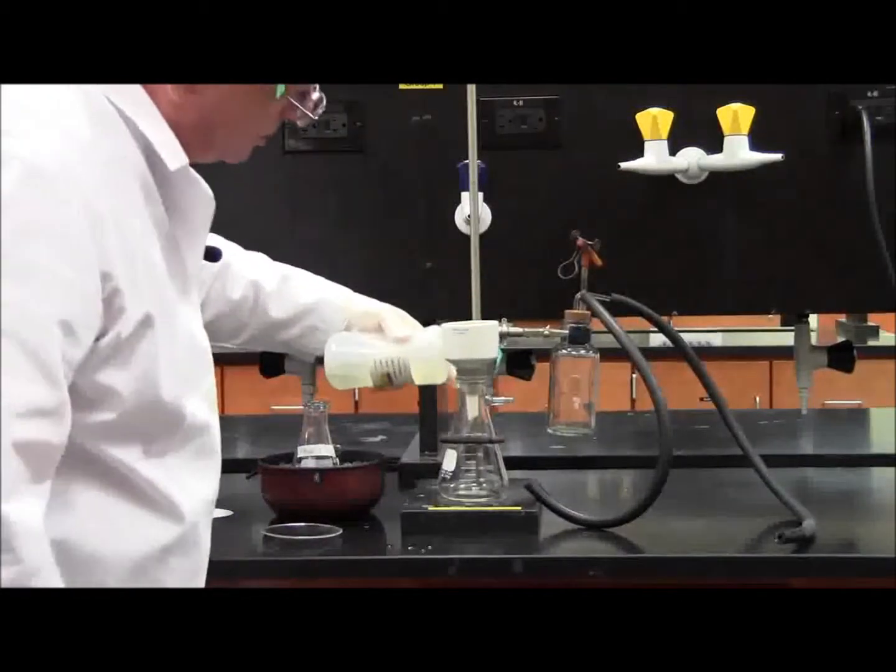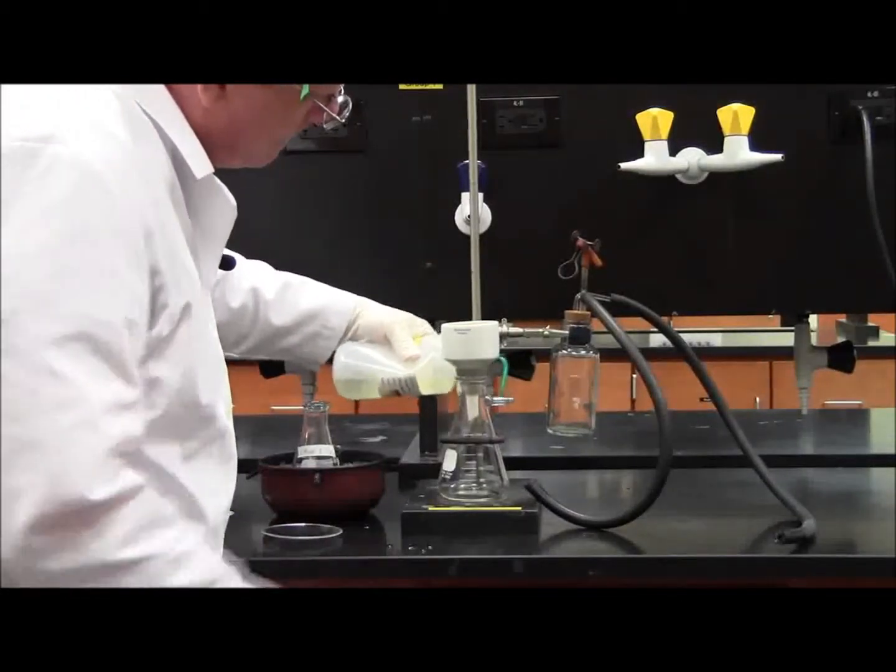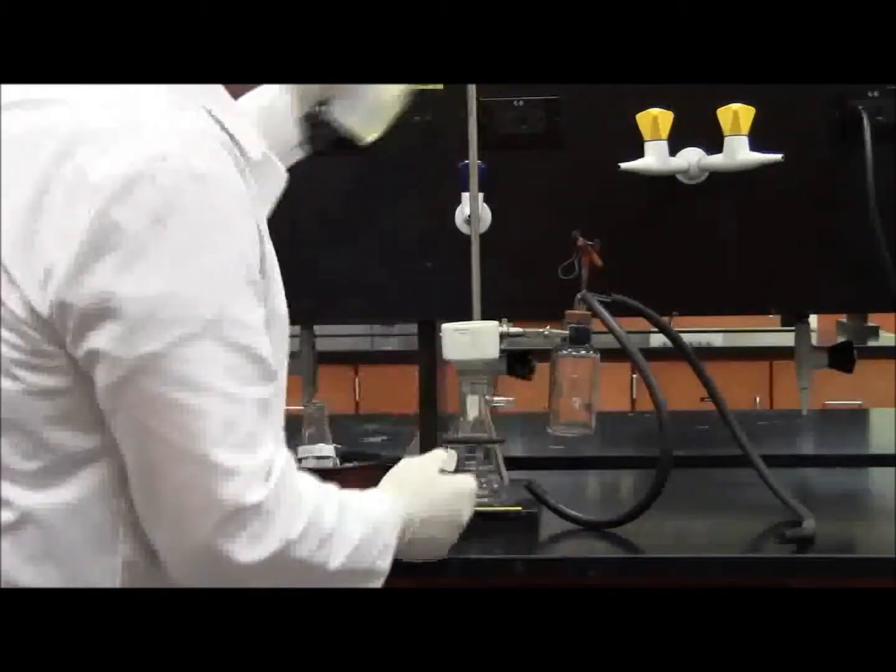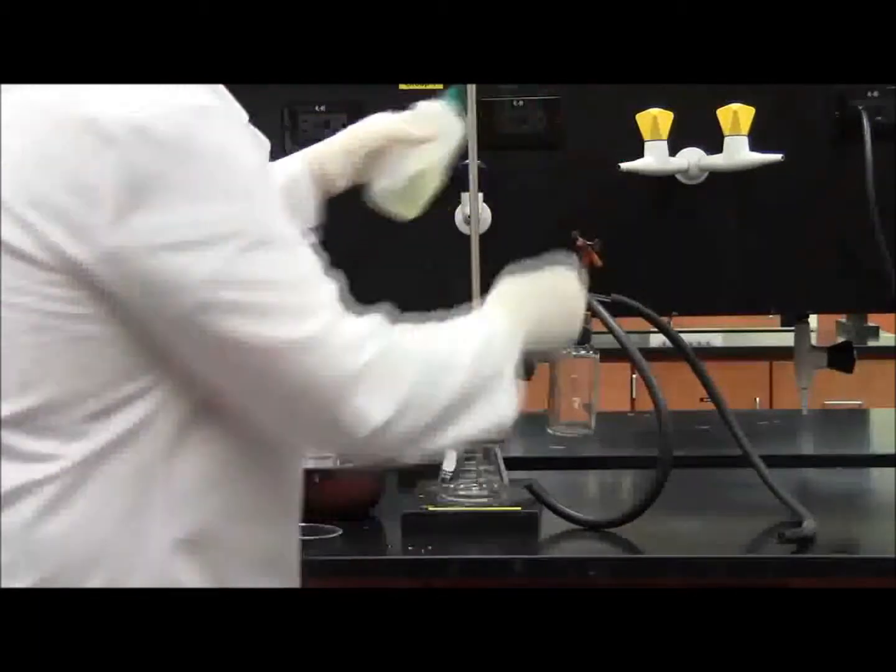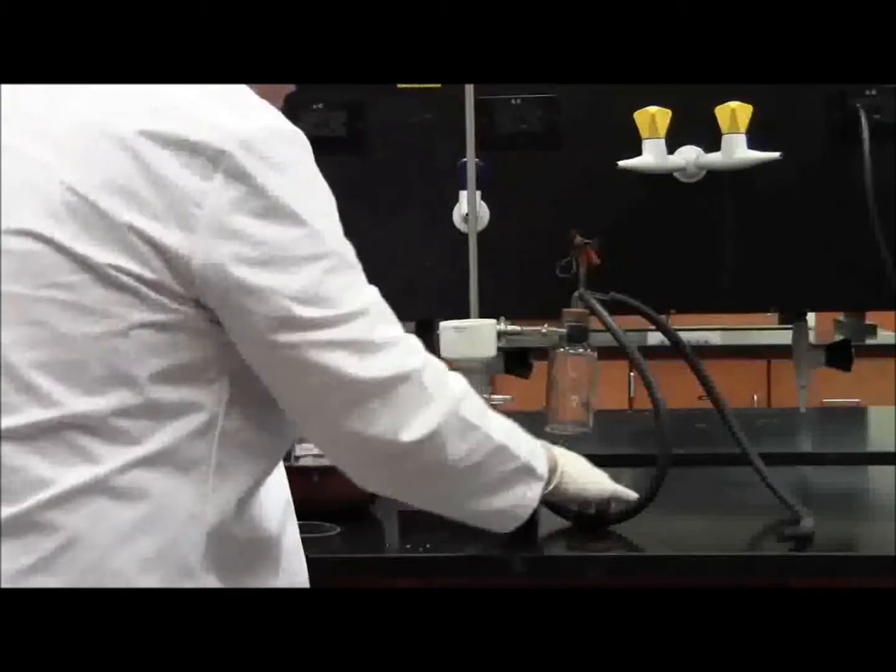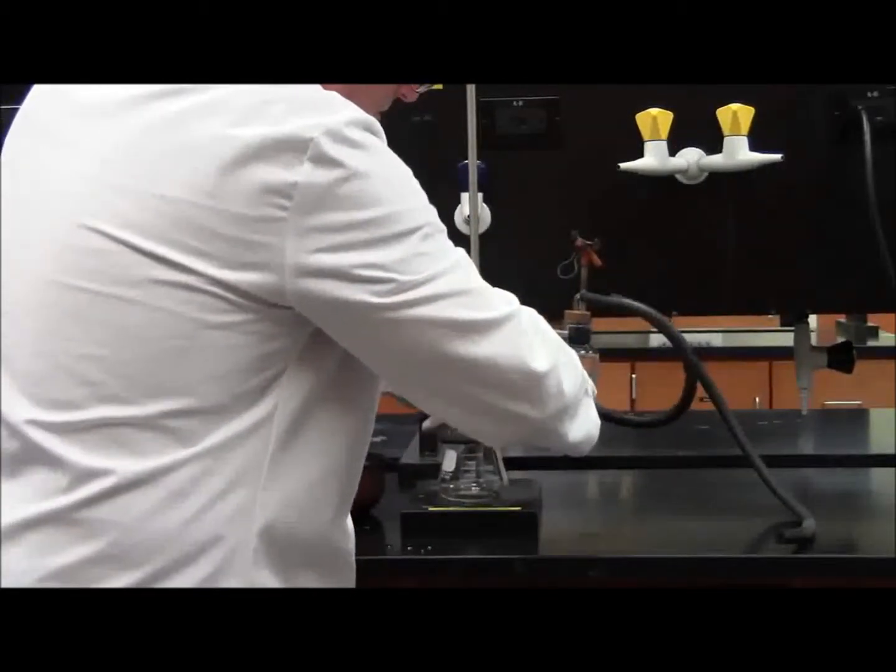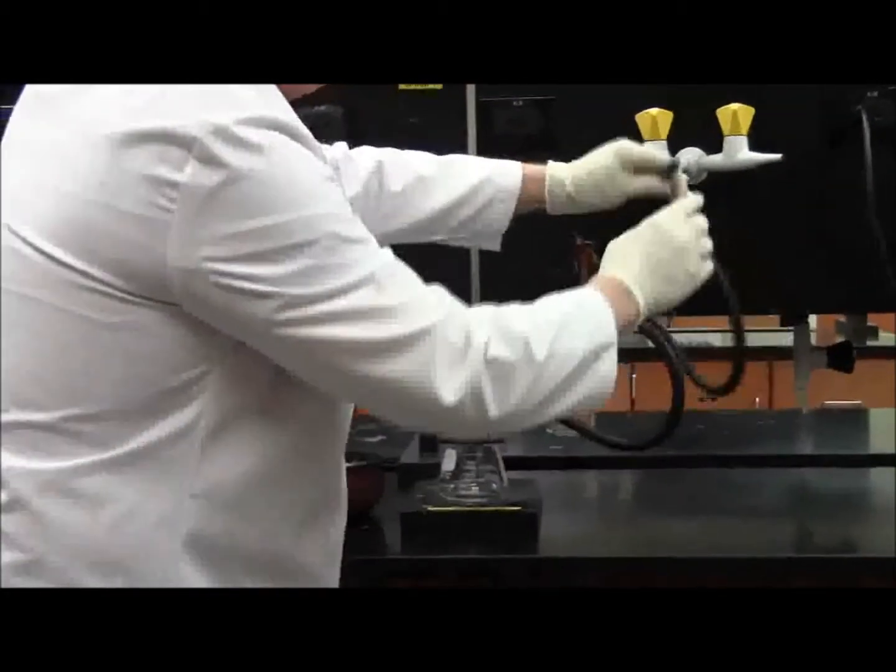To do this, you're going to want to use a little glycerin, put it around. This way, the vacuum hose will go on easy and it will come off easy.